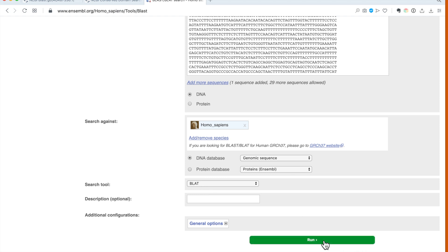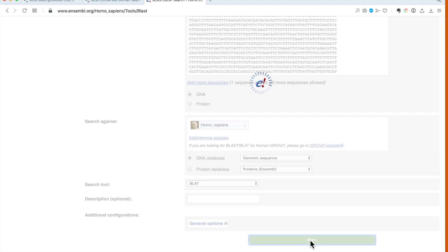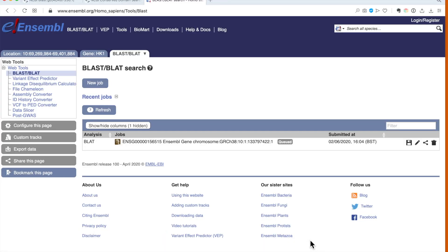So we just hit run and we have to wait while the search is going on in the background. This window will update us on the status. Queued means that we need to be patient.